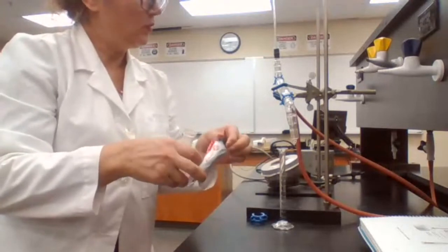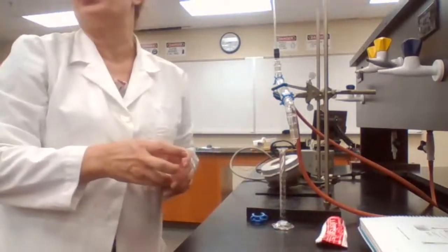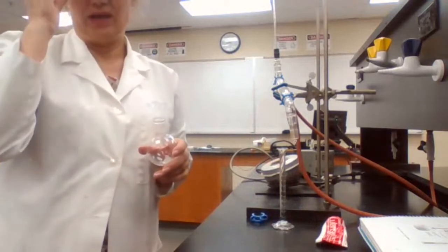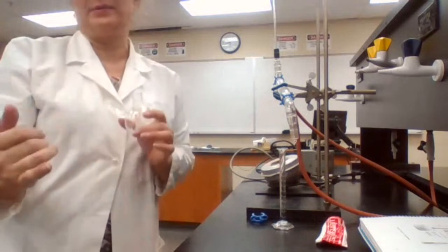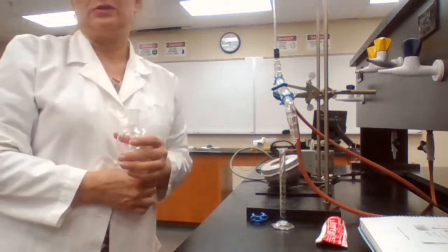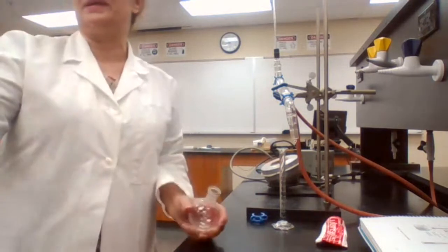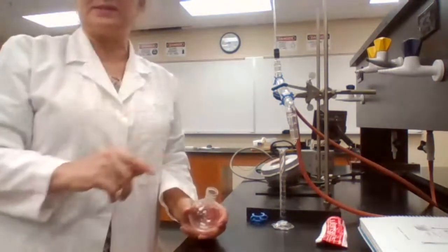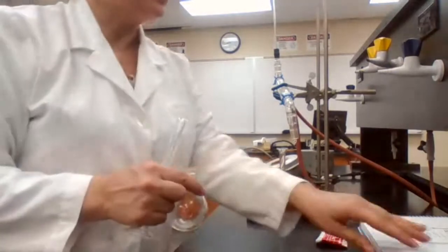And what is the purpose of greasing the glass joint? There are two purposes for that. I mentioned one, and I would like to ask you for the other purpose. While I'm getting the chemicals, please write your response. How much of chemicals should I use?